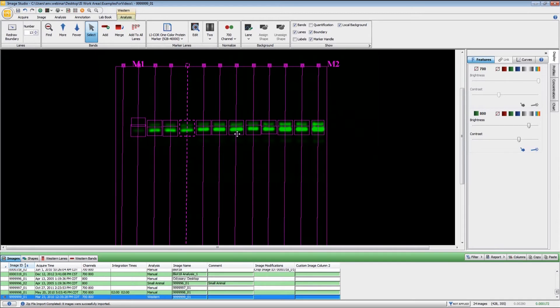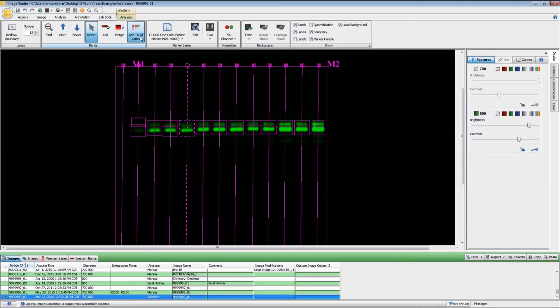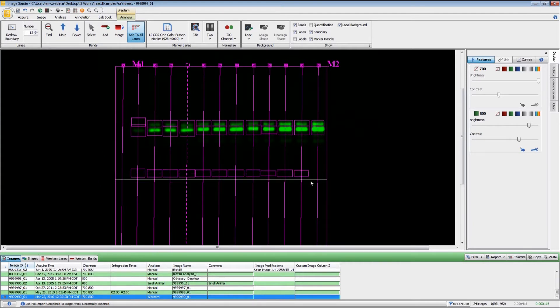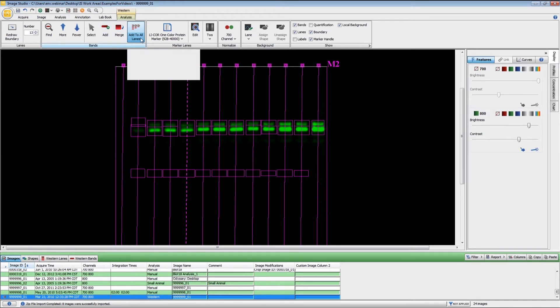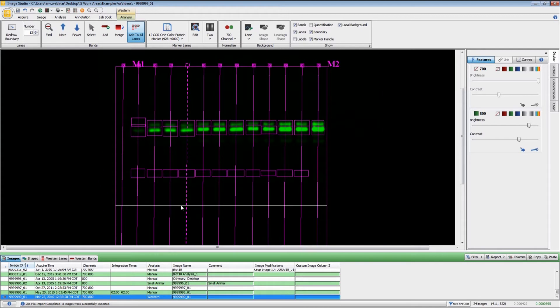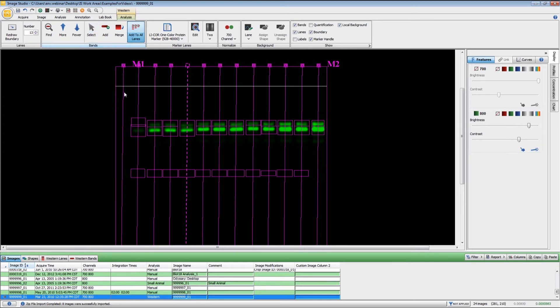One thing that we have added to the software in this version is the ability to add bands to all of the lanes. These are all of the non-marker lanes. When I click that, you will see that there is a line here. Then I can use that to position and place band markers all the way across there. With both the add and the add to all lanes, you'll notice that I'm still in that mode. If I want to go back and edit any of the lanes, I either need to click here on the select or you can also use the escape key on the keyboard for the same purpose.